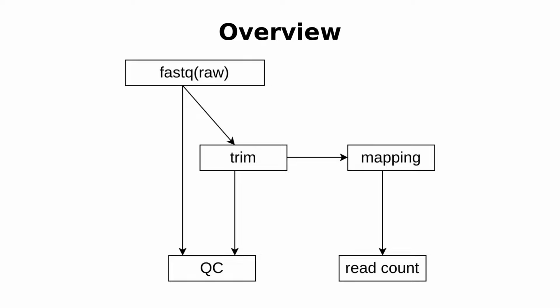When it comes to the trimming, it's situation dependent. It's not always that you have to trim. You need to first assess the quality of the reads. You can do it for some of the files just to make sure they are okay. If they can be improved, then you can add trimming. The trimming here, I added because initially I did some checks and I realized that the reads can be improved. We can improve them by removing the low quality ends. So that's why I had to bring it in.